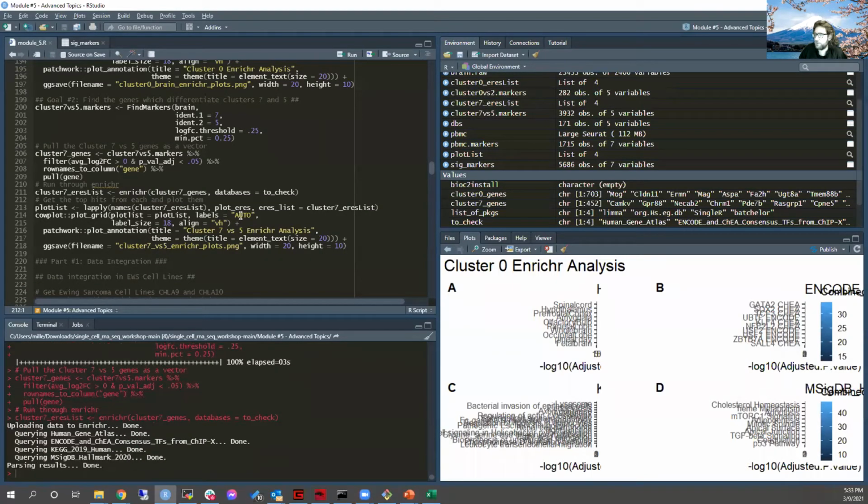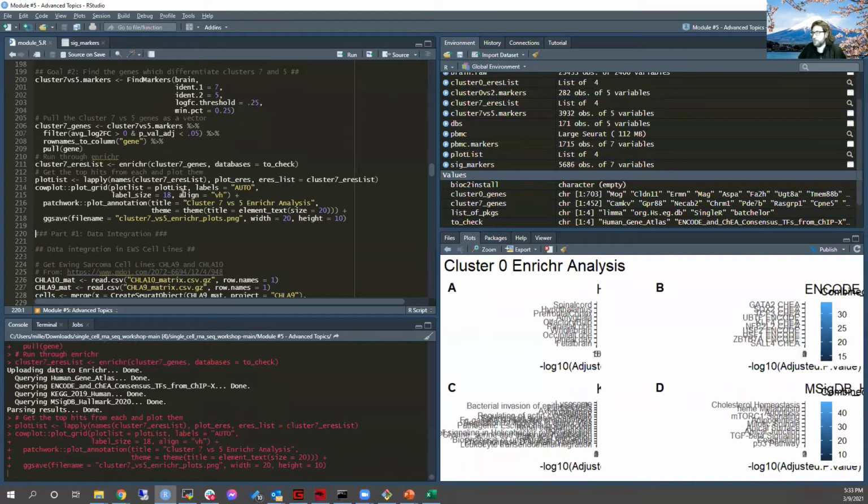Go ahead and upload that to Enrichr. Plot and save.